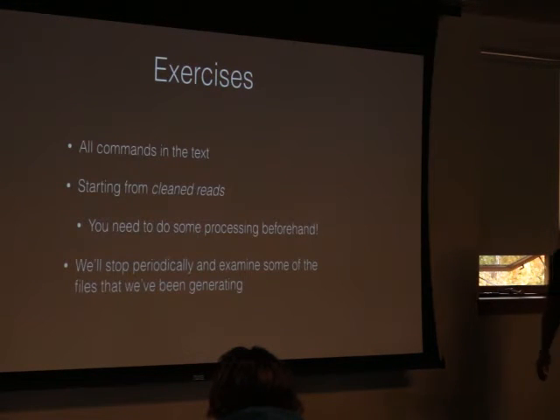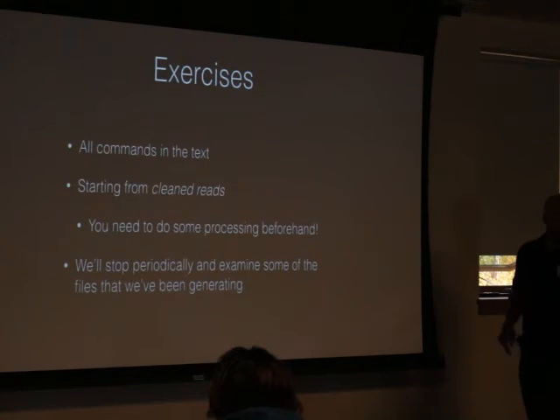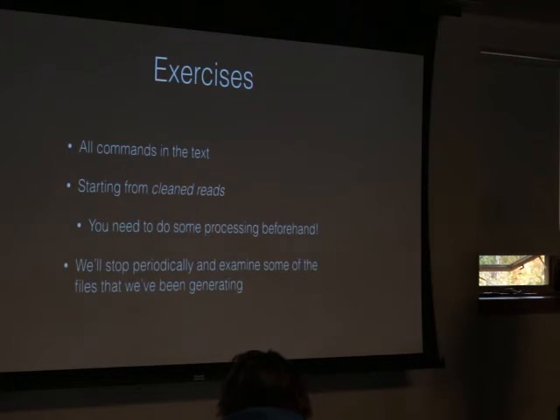So just a little bit about the exercise you're going to be doing here in a couple minutes. I've structured the document that I sent out so that there's a little bit of background material, and then for every command you're going to run, I explain what's going on behind the scenes. So there's going to be all sorts of information. You shouldn't necessarily need to go online and figure things out or look at manuals or anything like that, although you're more than welcome to if you want to learn what additional options might be available.